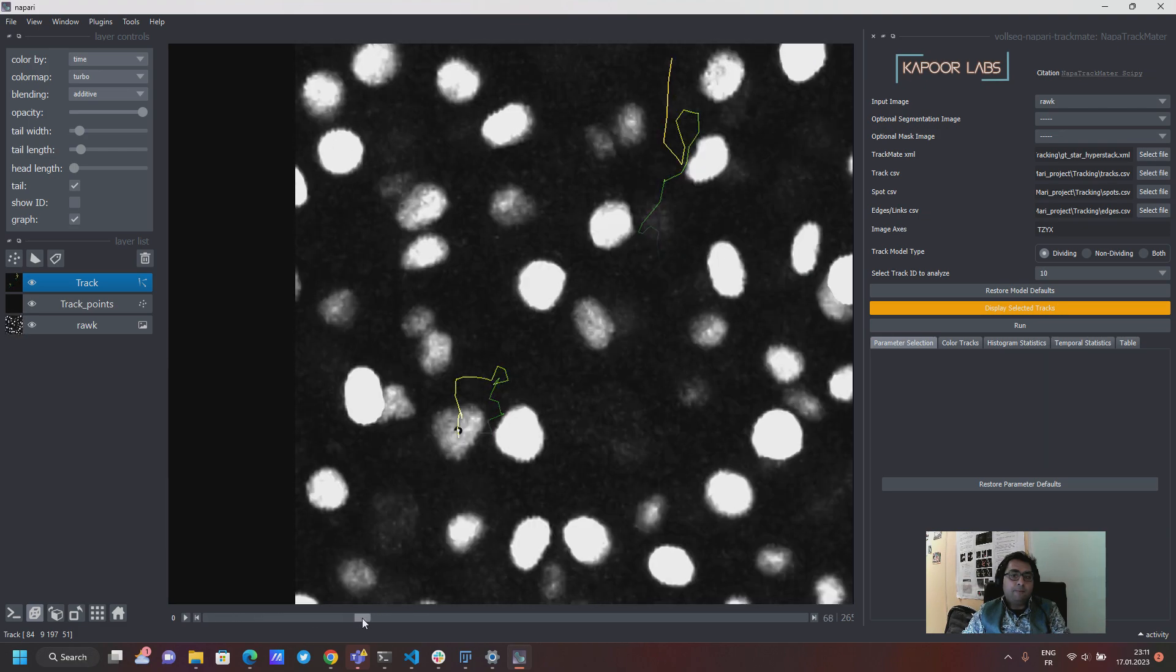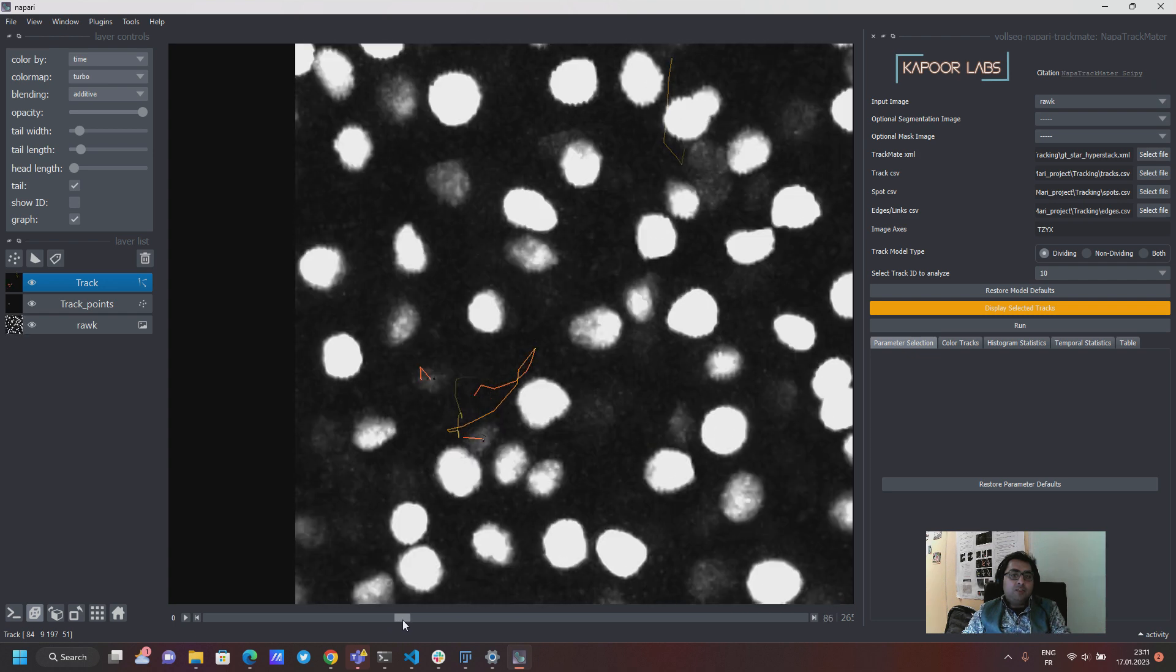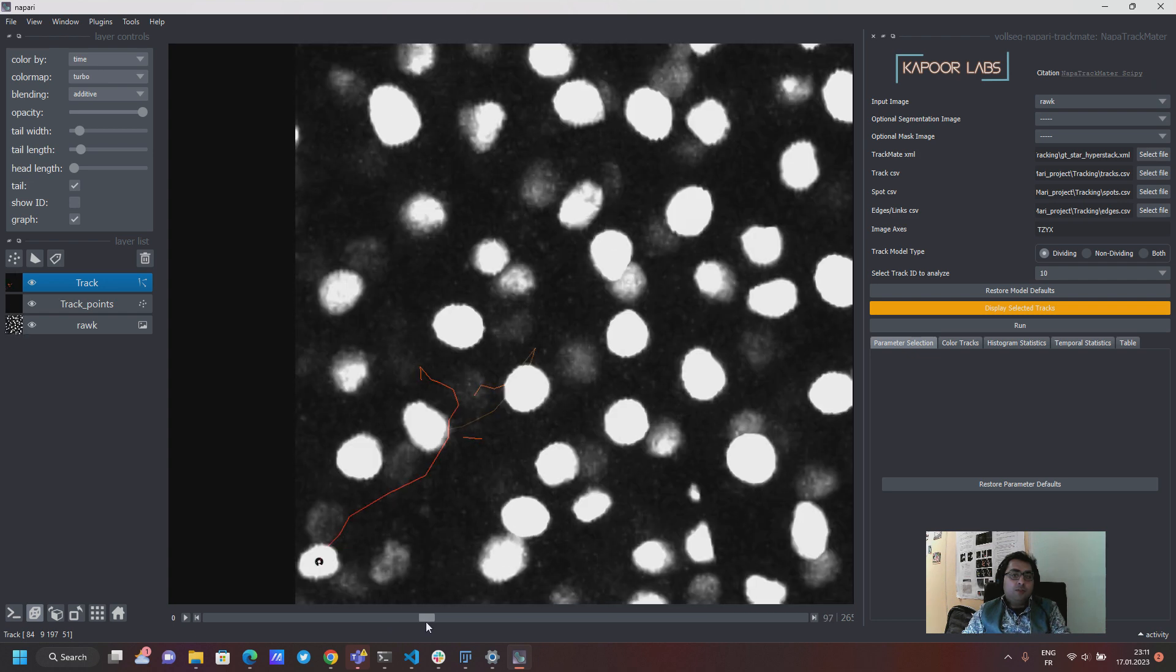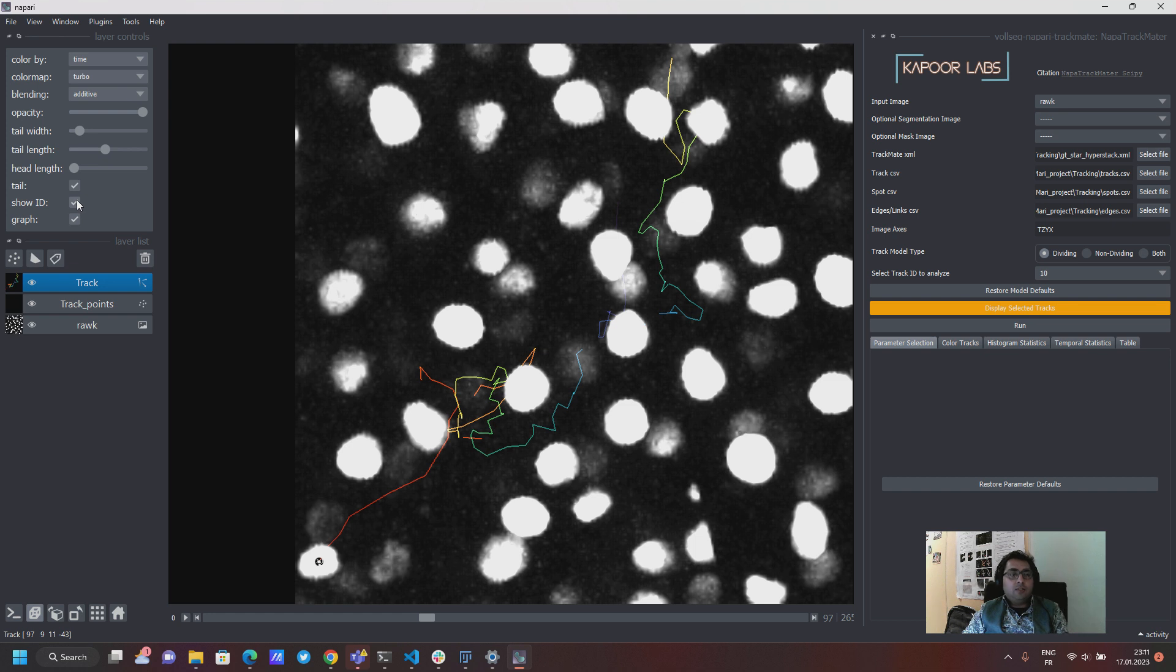And you can have these different visualization options where you can change for example the tail length and so on. This comes from Napari, this comes from me to show the ID of the track which you will see here on the little dot.